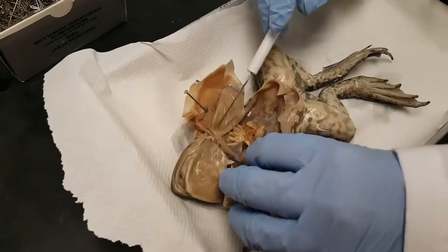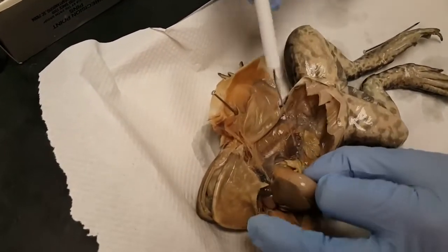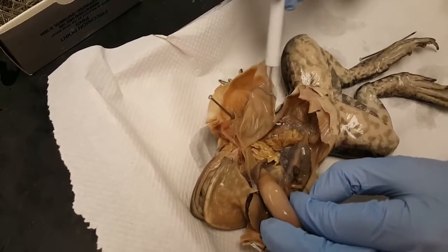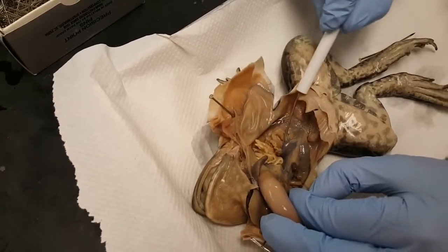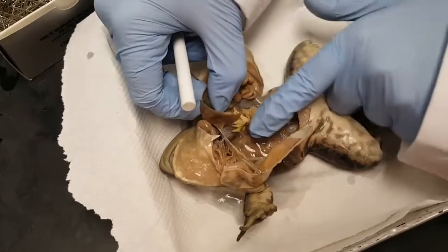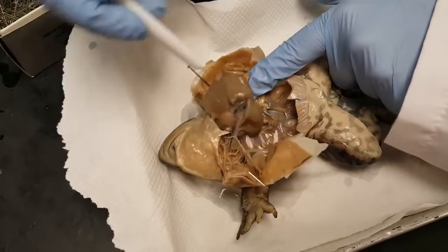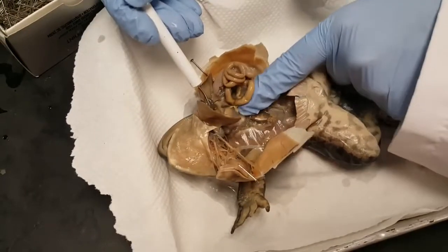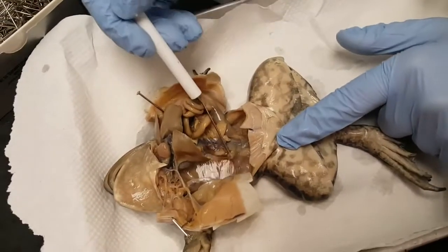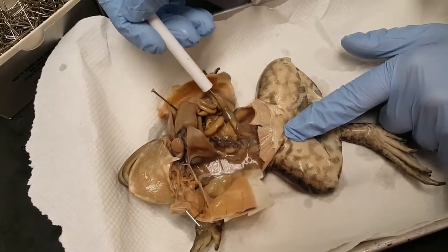Now I'm going to push this aside and look for the kidneys. If this is a male, we'll be able to find the kidneys and then potentially a little testy attached to them. There's a kidney — and I don't see a testy. So maybe this is a female that's just younger. Let's try the other side. And I do not see a testy on this side either. So she doesn't have eggs, but I'm going to call this a female because normally a male will have a testy right there. And these little curlicue structures around the kidney are the oviducts.